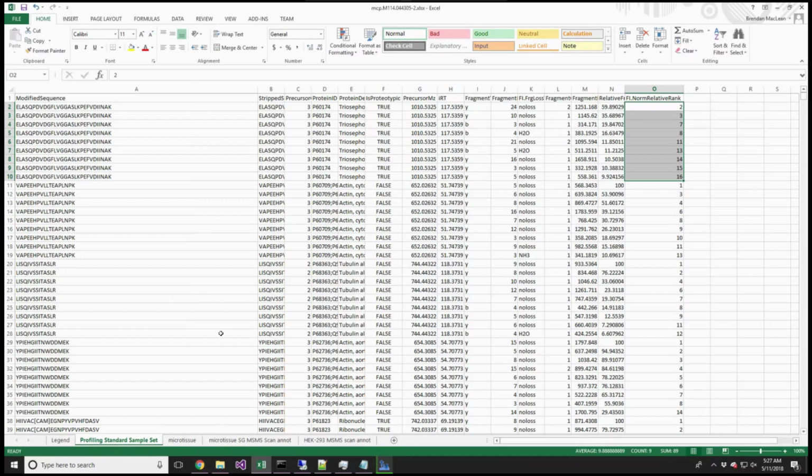Obviously they have standards for DDA, and now we realize that we're falling behind on DIA standards. There's not really enough. But when somebody tells you about building quality assay libraries or spectral libraries, to me, all the information about how to measure peptides and their useful spectra is totally useful, and you would use that for Skyline too.